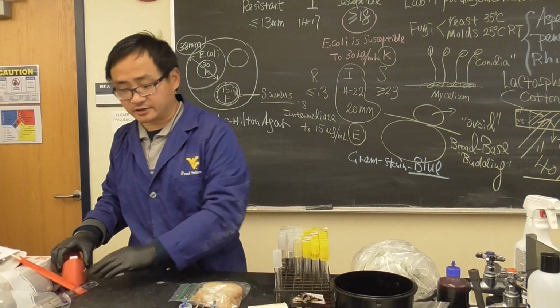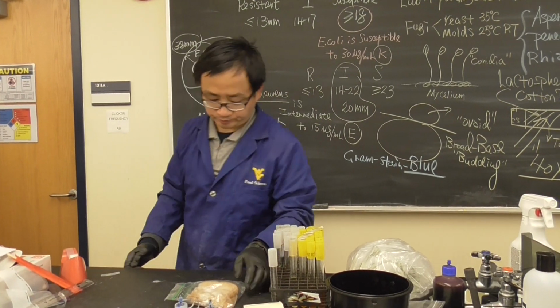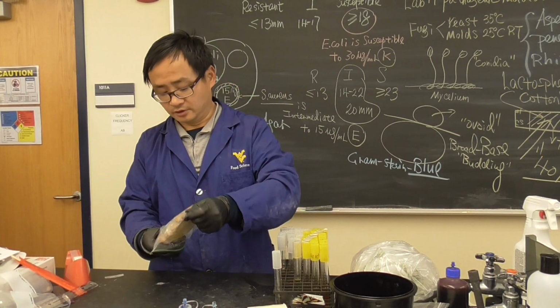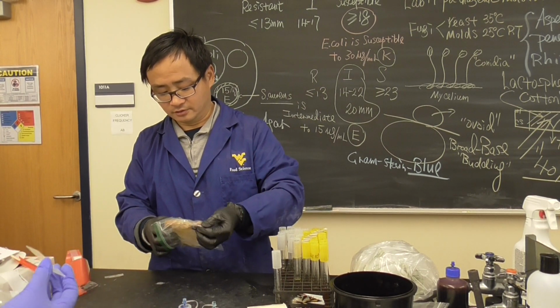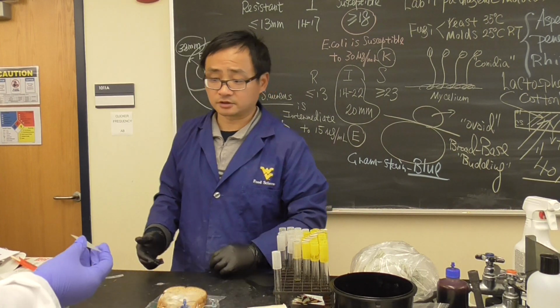Do you guys have glass slides? Can I have 1 glass slide? Yeah. This needs to be done carefully because it's really bad. There's cheese in the middle. Really bad. Look at this, so sticky it is. Look at this. Okay, very good.